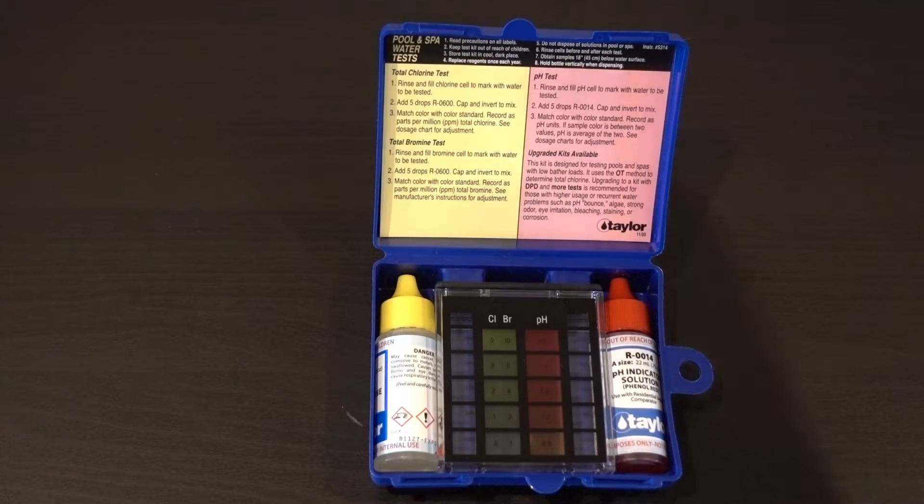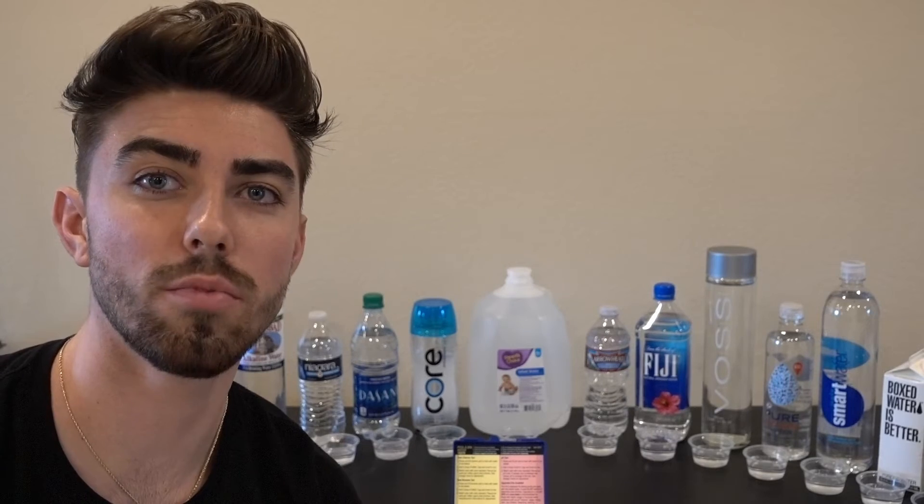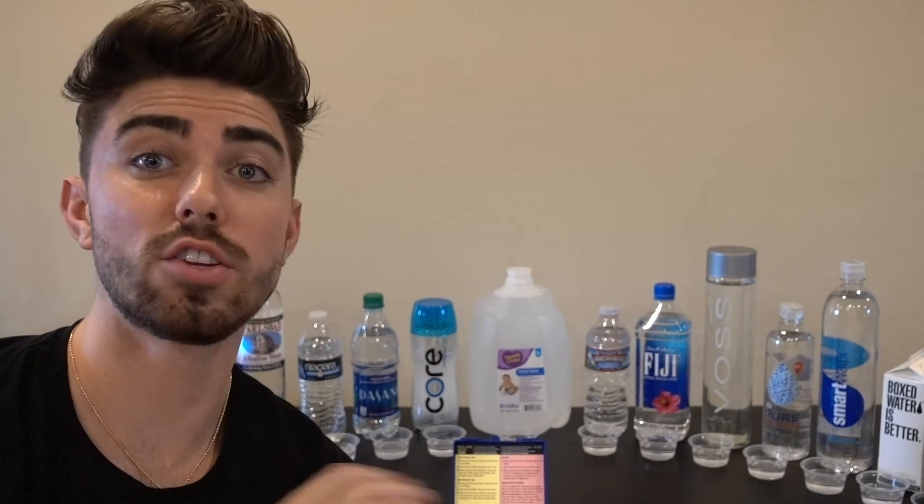Whether the water is acidic or more towards neutral, alkaline, aka basic. I also want to be as precise as possible with this, so I measured out the water in these plastic cups, and for each cup I'm going to put exactly seven drops in each one.